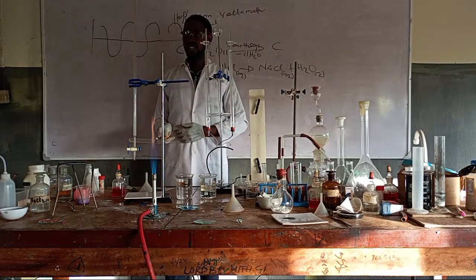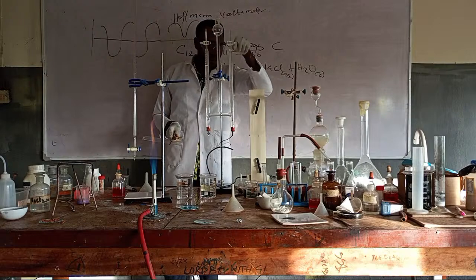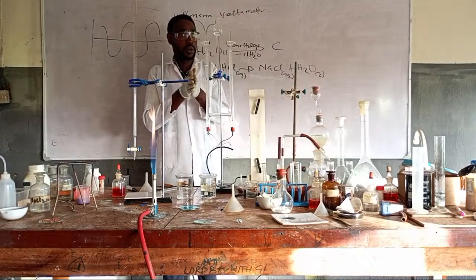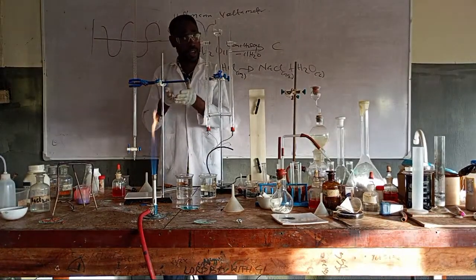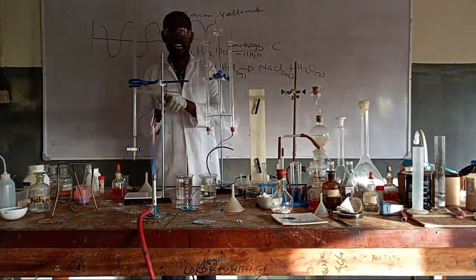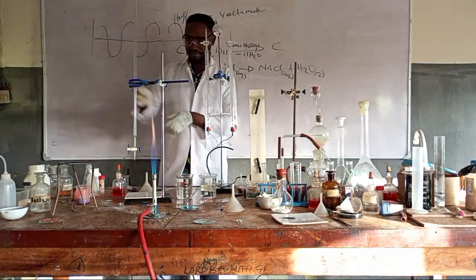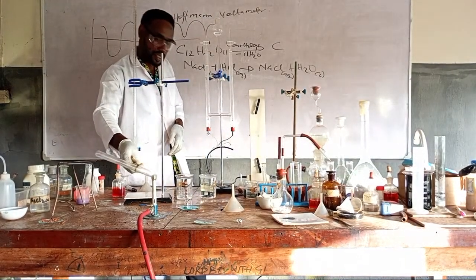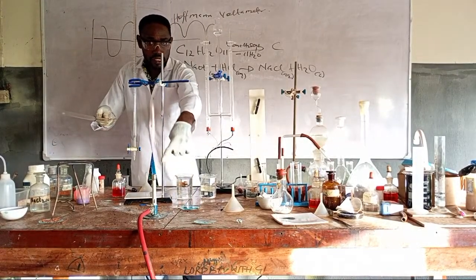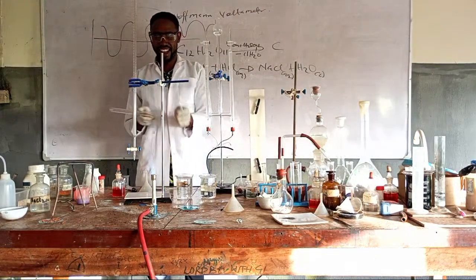The gas is not yet there. Are you not understanding it? I've used it, so now wait for another one. I've not tested oxygen. You are laughing now. Hydrogen burns with a pop sound. You have seen it now. Let me check if it is this thing that is making that sound or the gas, returning it back to the fire again. Are you seeing it? It's green. No, the unburnt copper is still there. So don't attribute it here.